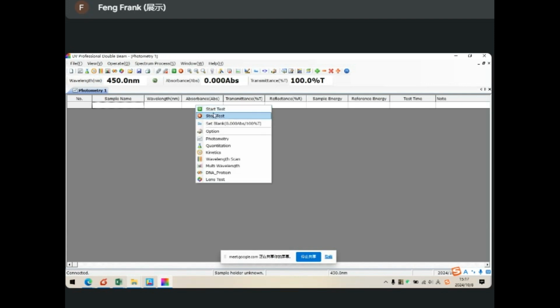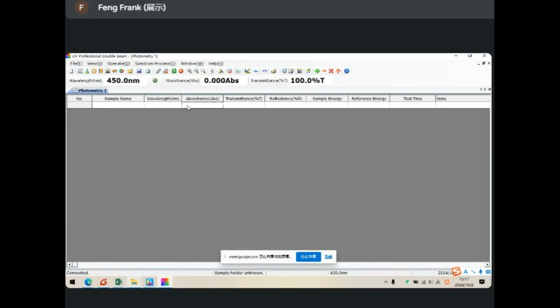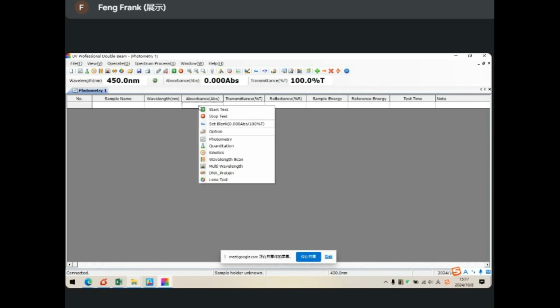It's my habit, I usually do the operations like this. Start. Okay, here you can name your sample name, or later you can change it directly. For example, I can name it VN.